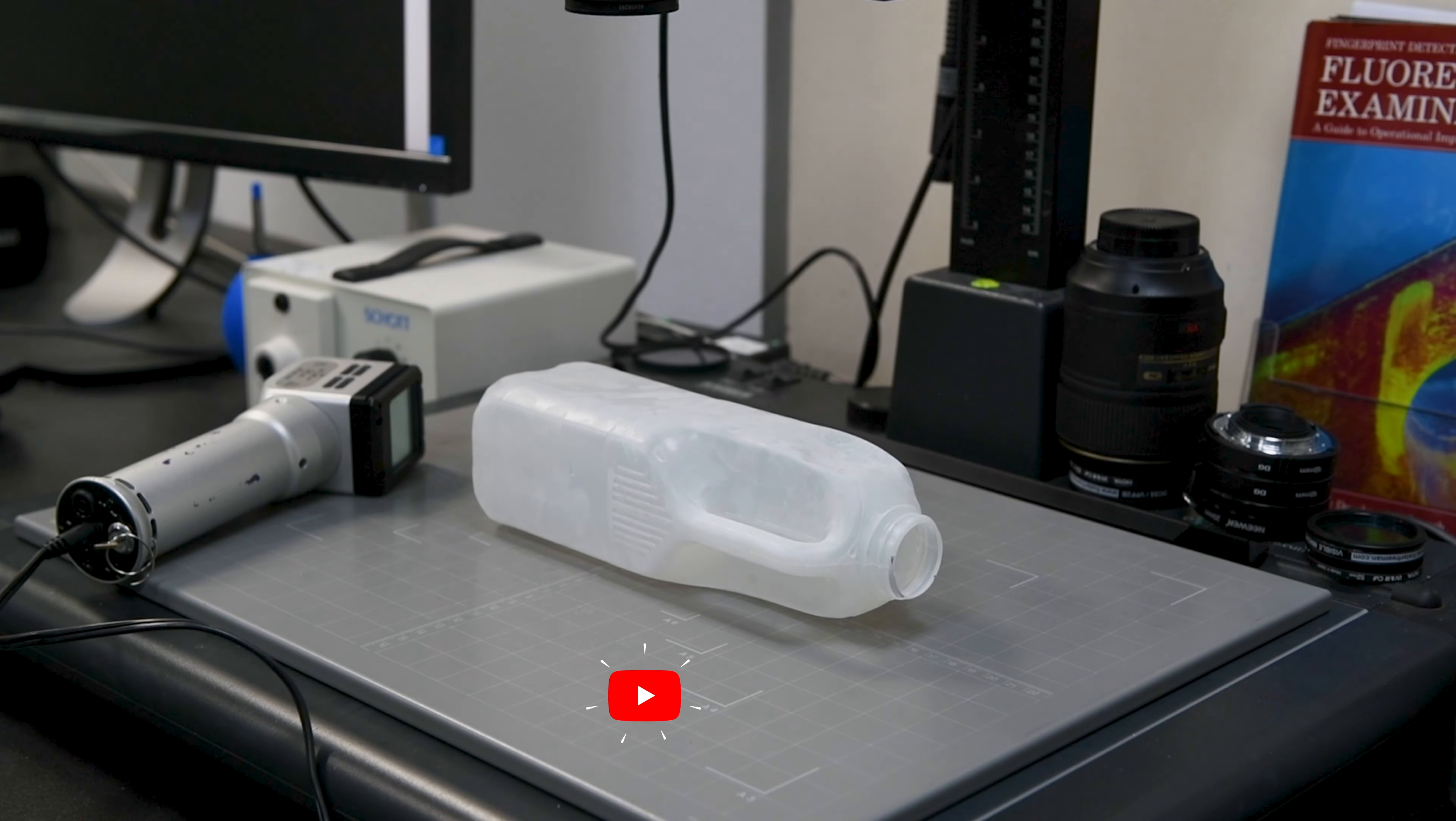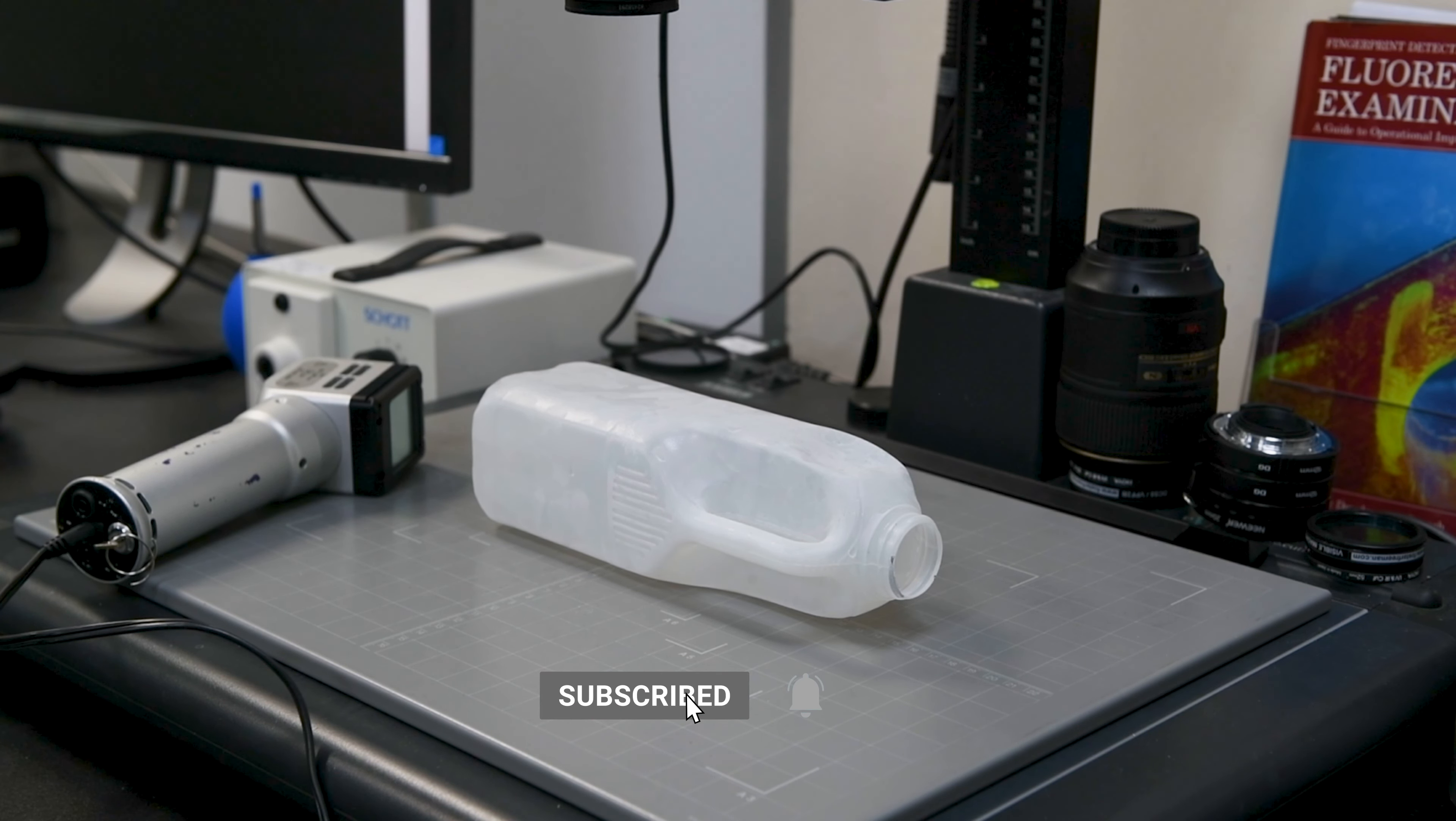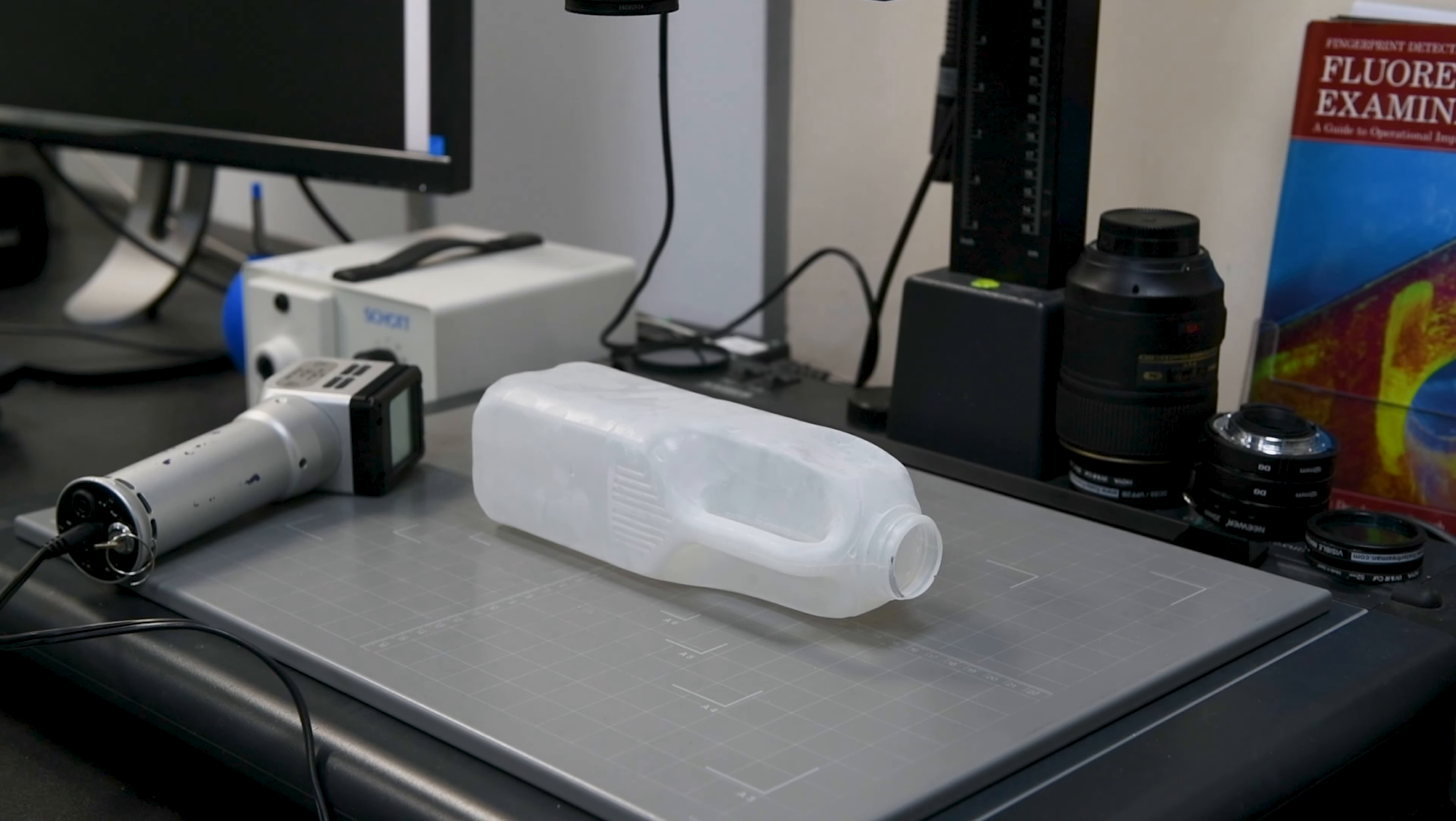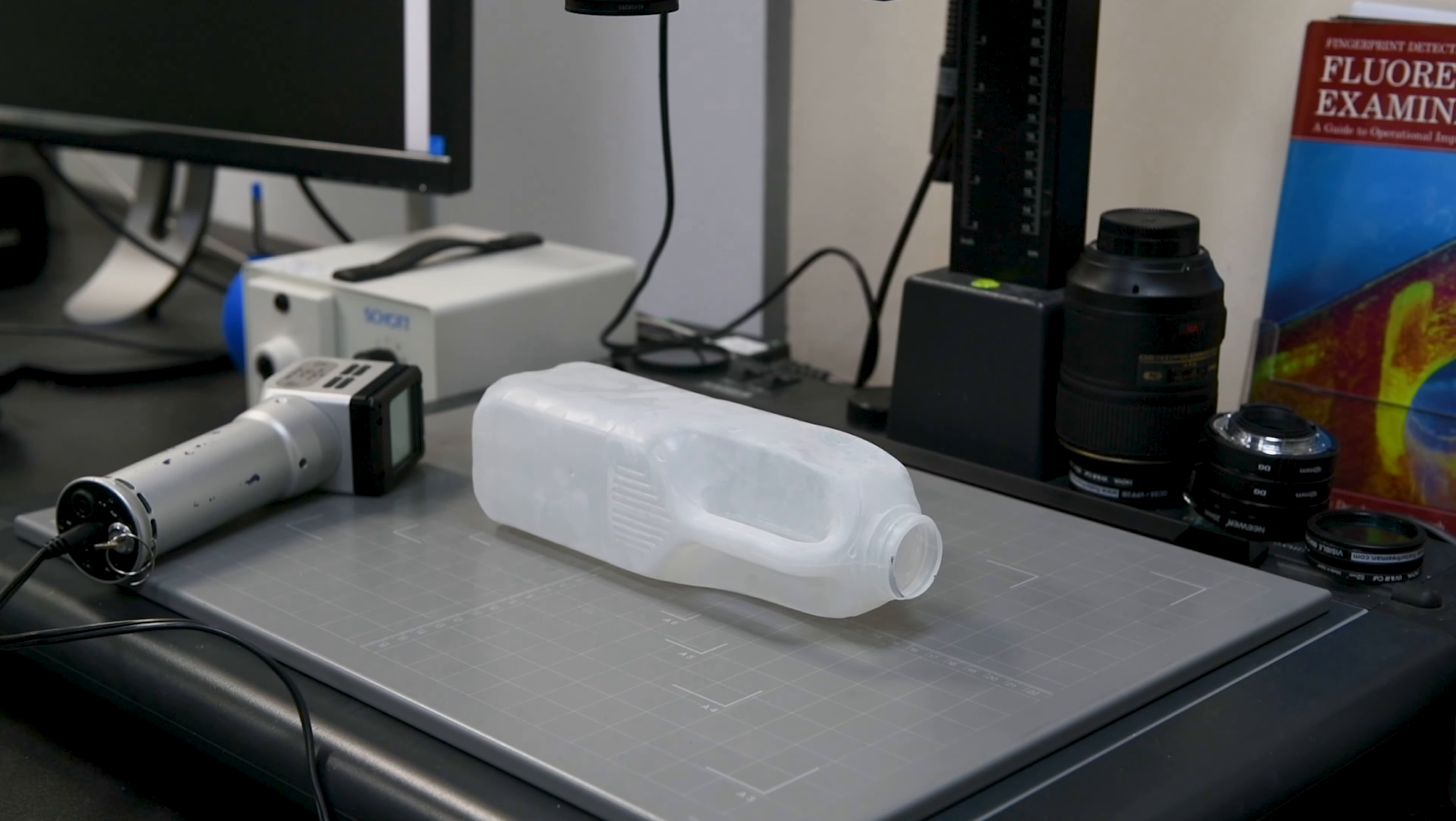When cyanoacrylate is used as the treatment, we're able to use long-wave reflected UV to photograph the finger marks. This is a really effective technique when cyanoacrylate is used.